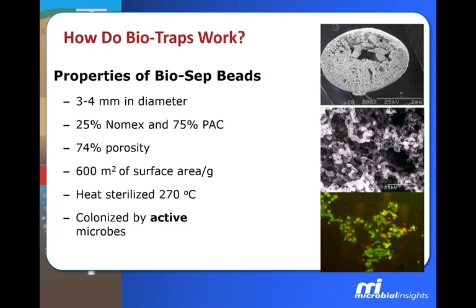Another thing to know about a biotrap is that it's an integrated sample that we take, not a snapshot sample. When we deploy a biotrap in a groundwater monitoring well, for example, and it's incubated there 30 days or so, the biofilms that are formed on the inside of these beads then are coming into equilibrium with the sampled environment. So we're basically providing an integrated sample versus a snapshot, where a snapshot might be going out and simply taking a groundwater sample and filtering it and sending that off to the laboratory for analysis.